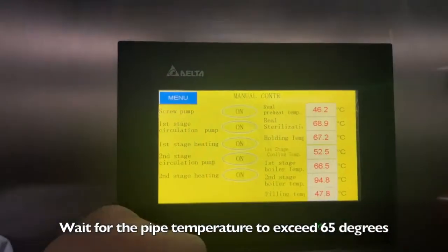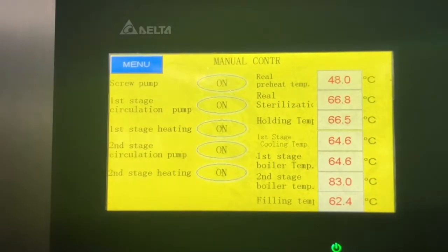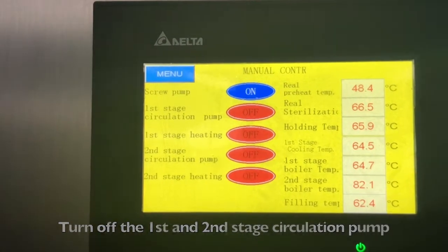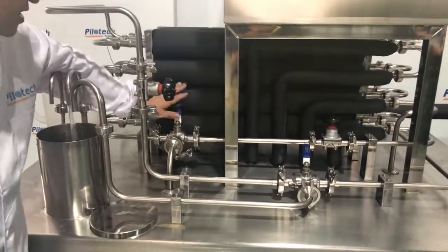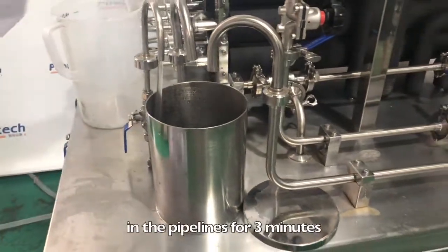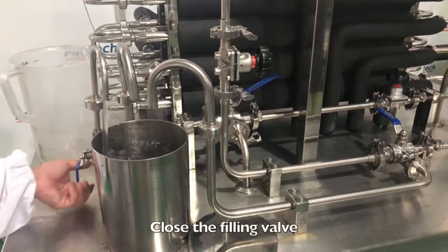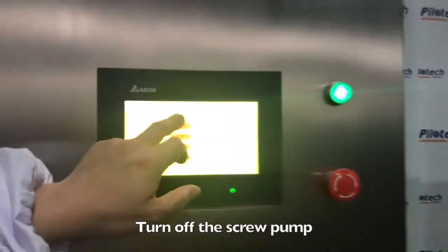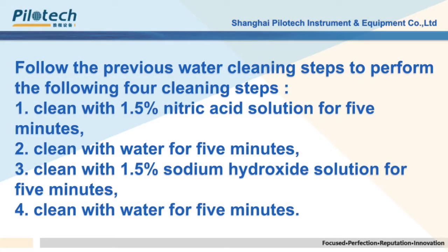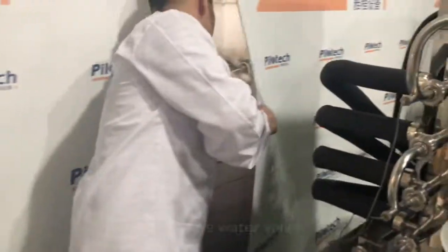Wait for the pipe temperature to exceed 65 degrees. After 5 minutes of circulation, turn off the first and second stage circulation pumps. Turn the three-way valve to the drain position. Add clean water to drain the sewage in the pipelines for 3 minutes. Close the filling valve and turn off the screw pump. After CIP cleaning is complete, turn off the touch screen and close the water valve.